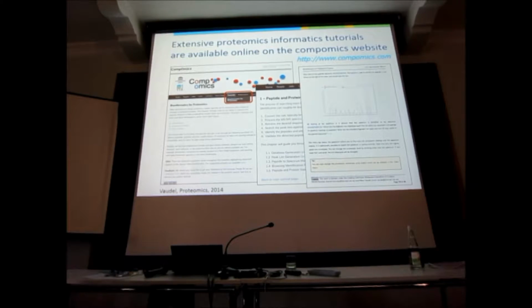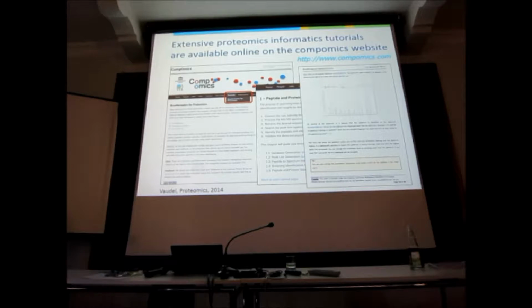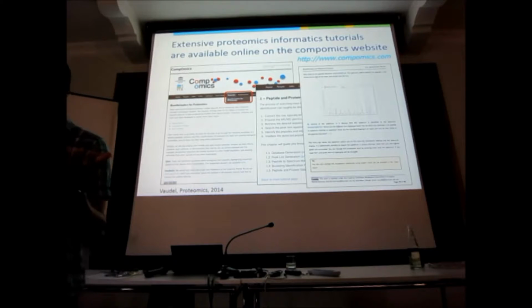We tend to think they're quite professionally made. We use them a lot in workshops around the world. And they have nice screenshots of what you should see on your screen when you do certain things. They explain everything really nicely. They use colors. They have tips. The tips can be about the software, but they can also be about your research. And most importantly of all, they have these italics sections. The sections in italics are questions. Every question is numbered. This is question 1.4. And these questions go from very easy to very, very hard.